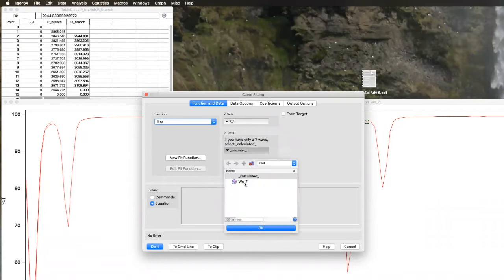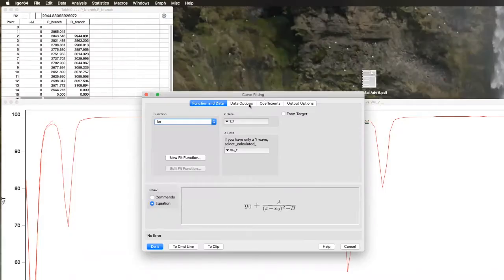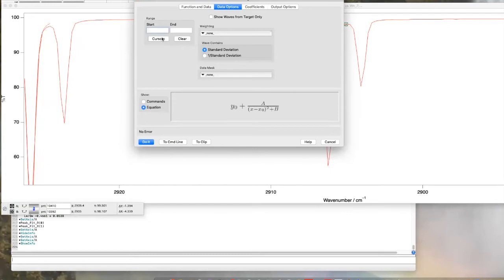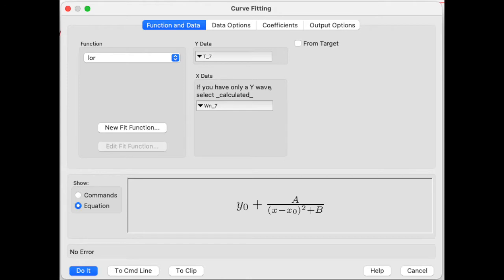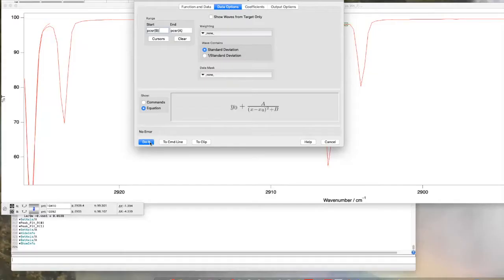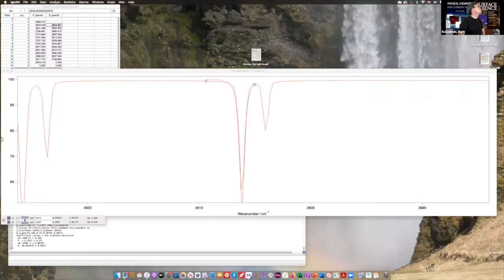We do curve fitting — pick the right function. T7 is the transmittance data and wavenumber7 is the appropriate wavenumber wave. We can do a Lorentzian. We're fitting between the cursors — we just want to fit the Lorentzian between the cursors. We do that — hey, doesn't look too bad! We get a peak position, though it doesn't necessarily fit the wings all that well.